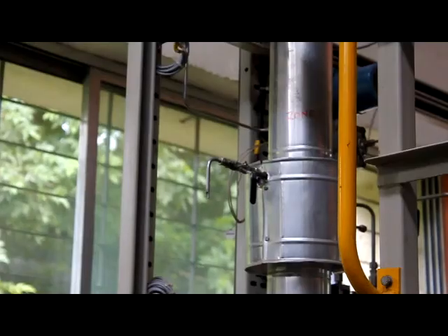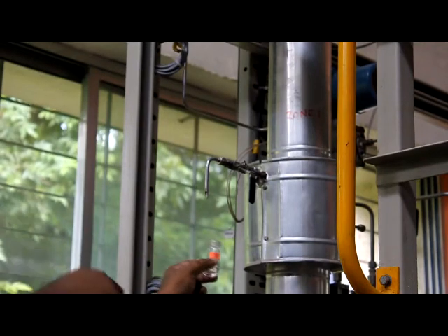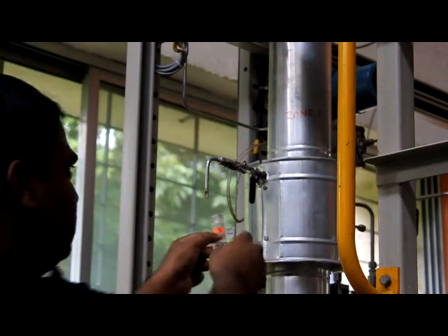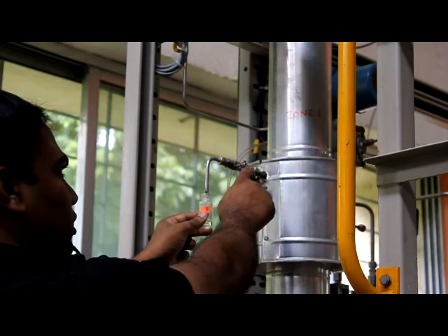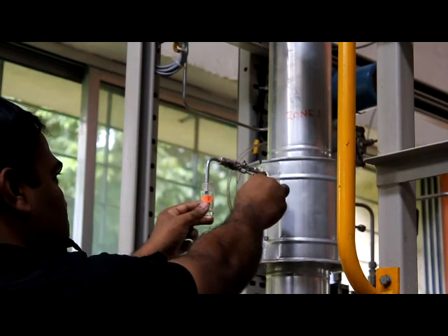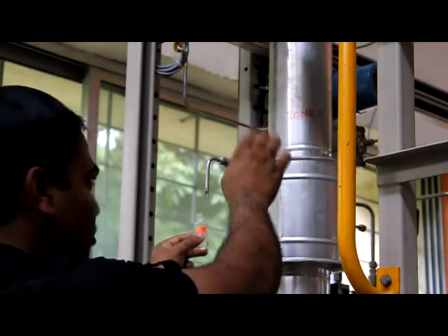Now we have to take the sample from the zone locations: the first zone, the second zone and the third zone. So this is the point where we can collect. Open the lock and move it slowly.